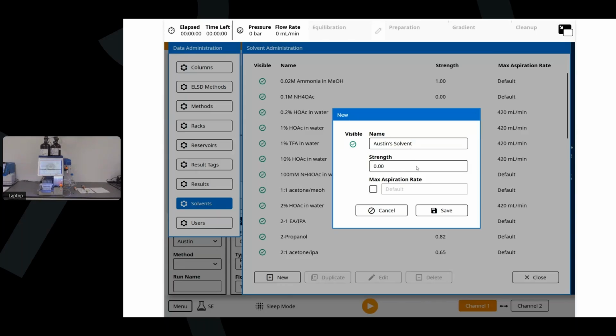And then again, strength is going to be really dependent on a couple of different factors. I guess the best way to kind of look at that is to compare it to other solvents. So, common systems are going to be ethyl acetate, hexanes, or maybe something like MTBE and hexane or heptane. Those are kind of where I start, at least for normal phase. MTBE is a little bit weaker. Ethyl acetate is kind of a universal in that sense, and play around to kind of identify the strength factor if you can't find it in the literature.